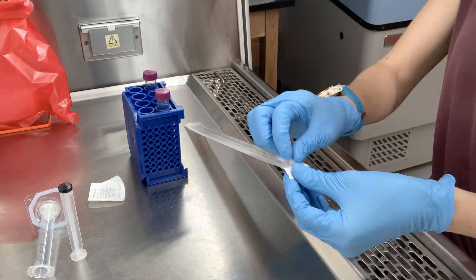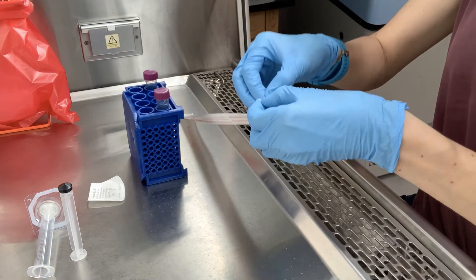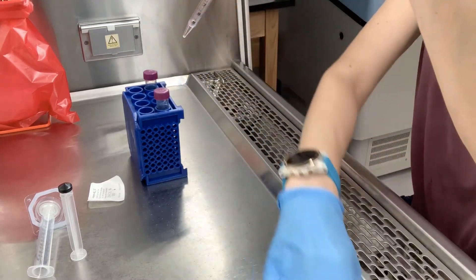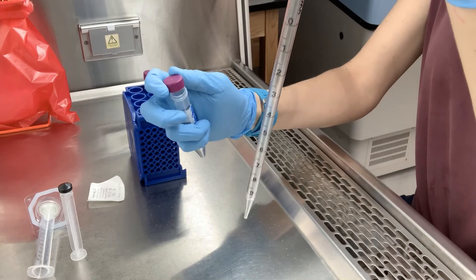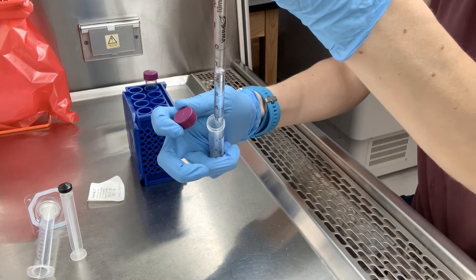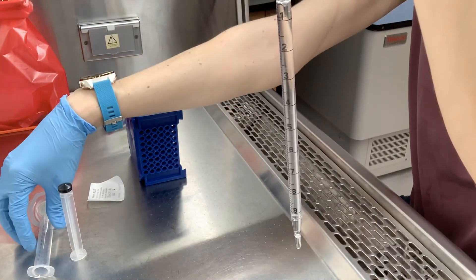Then open up your serological pipettes and draw up the non-sterile liquid that you aim to filter sterilize — this could be a solution of antibiotic, for example. I'm attaching the bulb onto the pipette. I've loosened the cap on the container previously so that I can easily open it with one hand, holding that cap in one hand while I draw up the solution with the other using my serological pipette. Once I've done that, I set the original container off to the side.